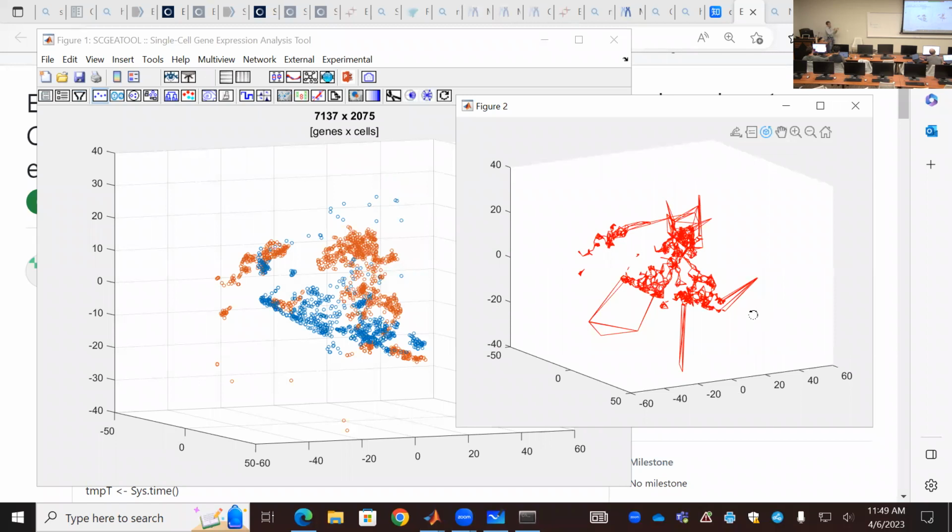No analysis will be done with this, it's just a visualization tool, okay? To give you some idea about it. So if you have a very complex structure, you can use these small steps to go through a very irregular shape of your cell cloud or other types of structure, okay?